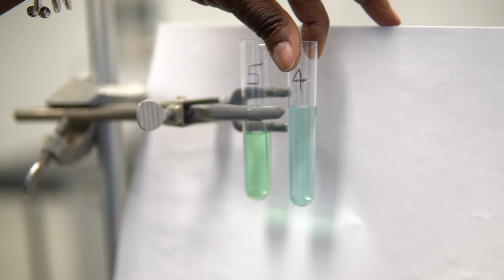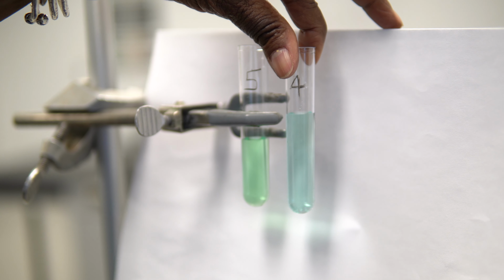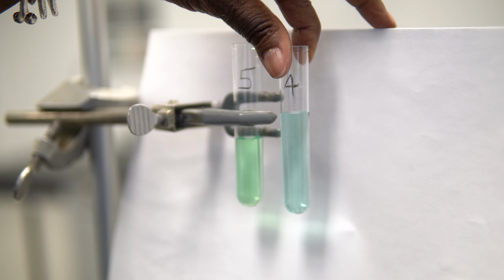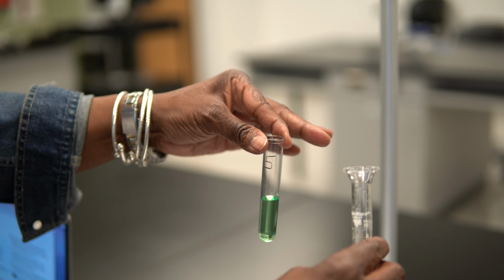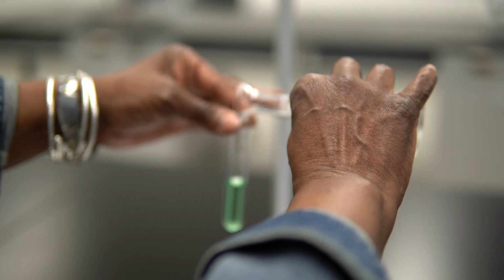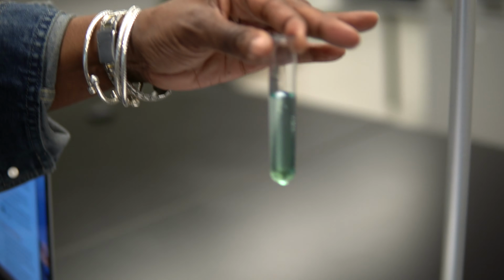Record these colors in data table 1. Also take a photo of test tube number 4 and test tube 5. Add 3 milliliters of water to test tube number 5 and stir with a pipette. Keep all test tubes for the next activity.